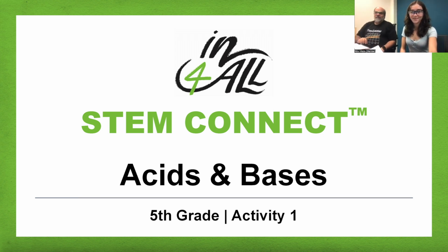So I taught chemistry for a long time, and this is a really fun activity that means a lot, especially in this day and age with the environmental effects of acids. It's got a great amount of applications for students. So let's walk through it a little bit and see if we can make it simpler for you to set up and collect data and so forth. All right, Dylan, let's take a look at what we've got.